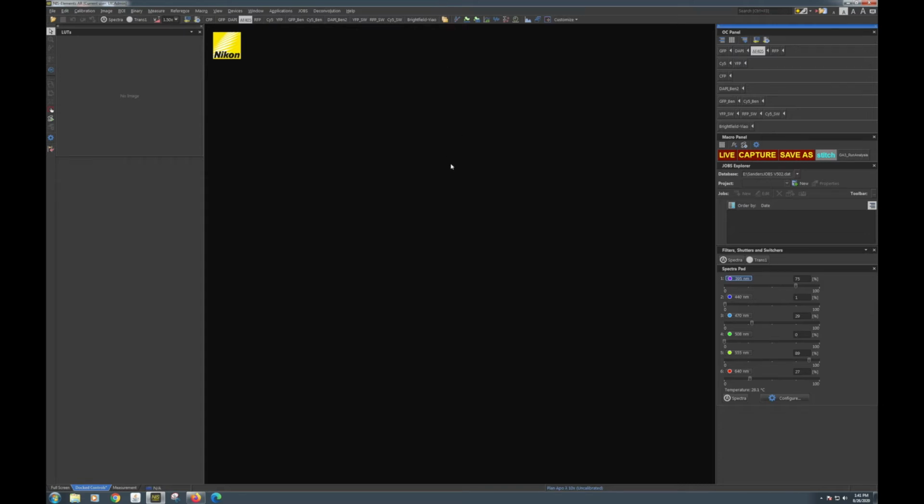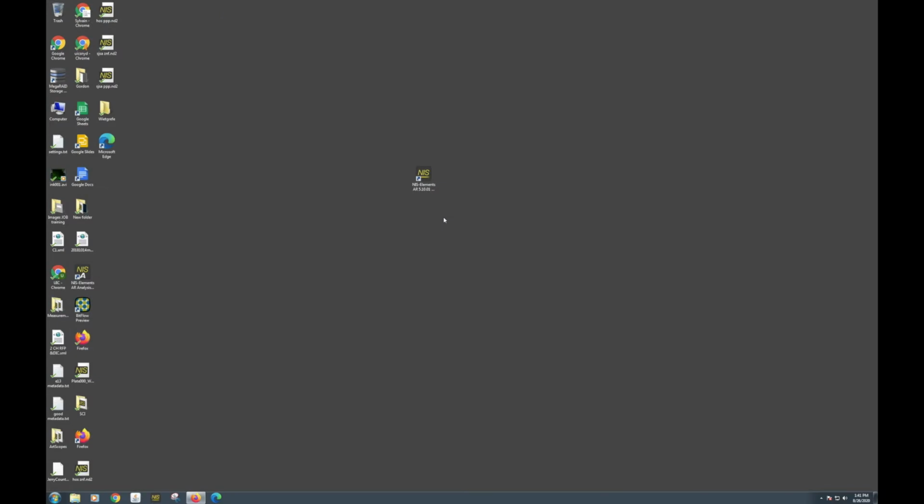This video demonstrates how to finish your session and log out of iLab after using UIC instruments. The first step in ending your session is to save your work and close the microscope software. Always remember to save your files to removable storage or server. Do not leave your files on the microscope computer.